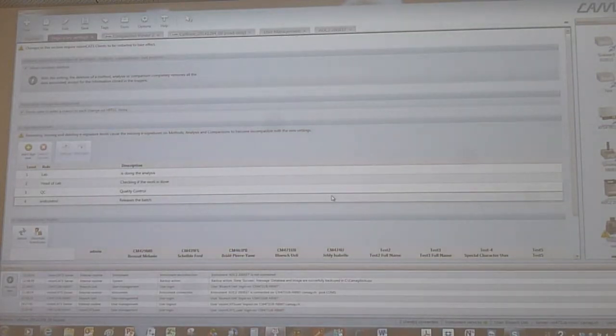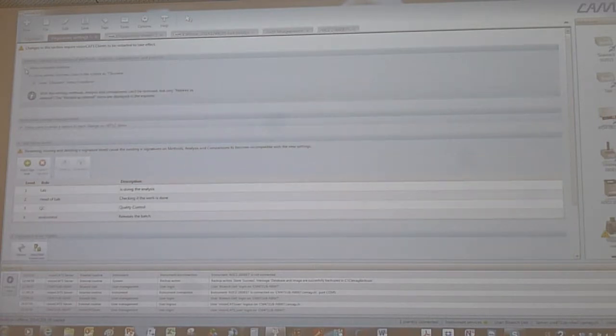Most of the companies, they go further on and say, no, we do not want deletion. So therefore here now I allow complete deletion. When I untick this, there are two other tick boxes. One is allow deletion but keep data in the system as obsolete. And the third one is show obsolete items. So that's simply the first tick box. If I tick that, I can delete.